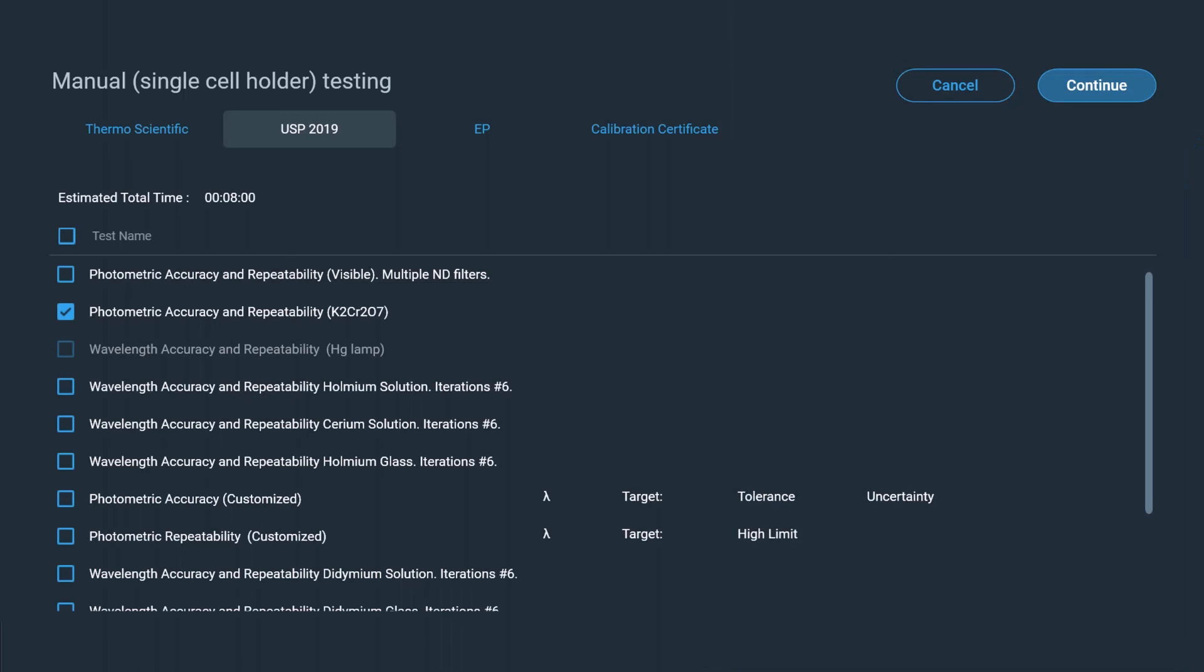Performance verification tests including wavelength accuracy and resolution are included in the software. These tests can be used to ensure the instrument is working as expected.